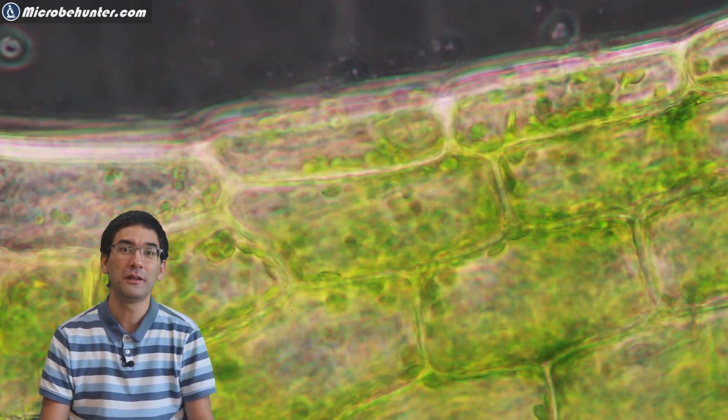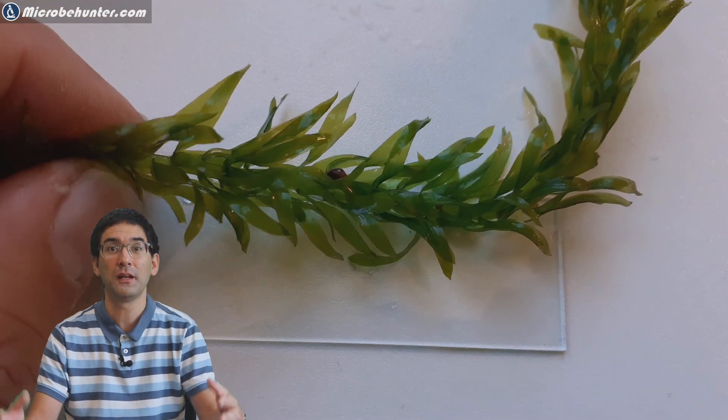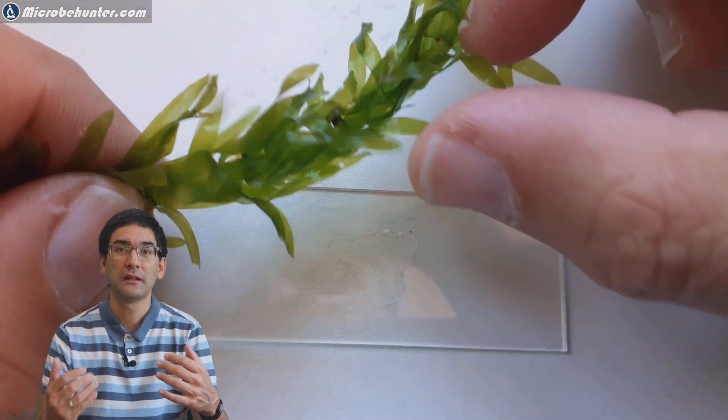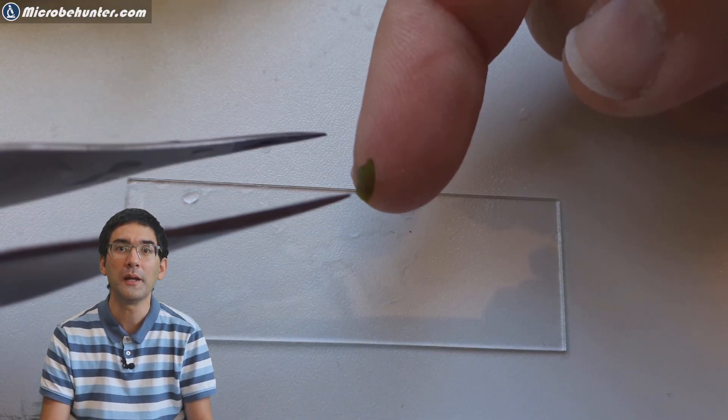I'm using different imaging techniques here. So for example, this here is phase contrast and it actually shows that using different techniques, you can actually see the chloroplasts in a slightly different way.